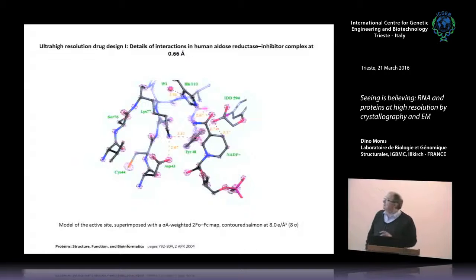This is an example, 10 years ago already. It's an ultra high resolution structure that was developed for drug design. For drug design, you need very accurate models. This is among, I think, the highest resolution.